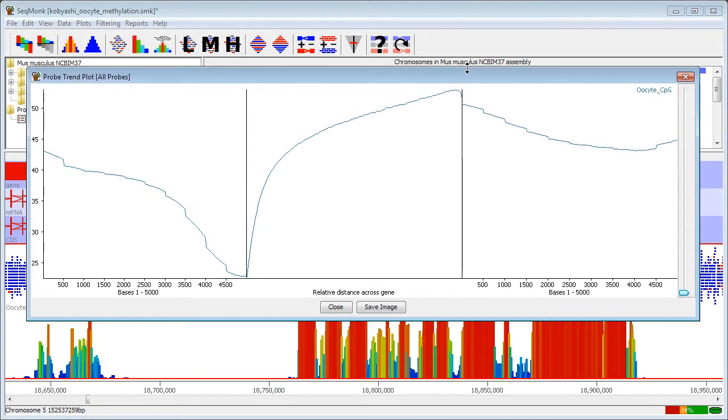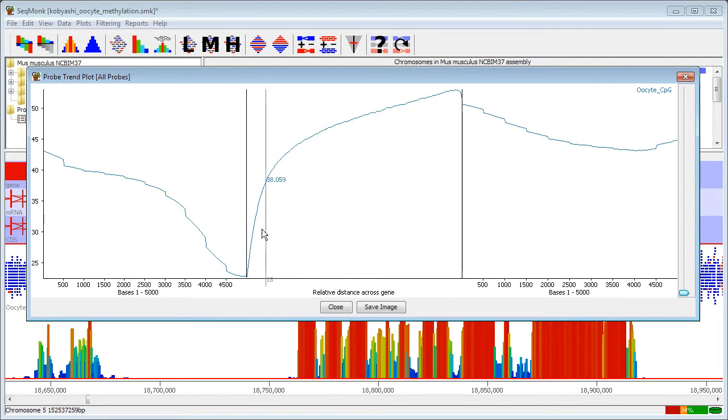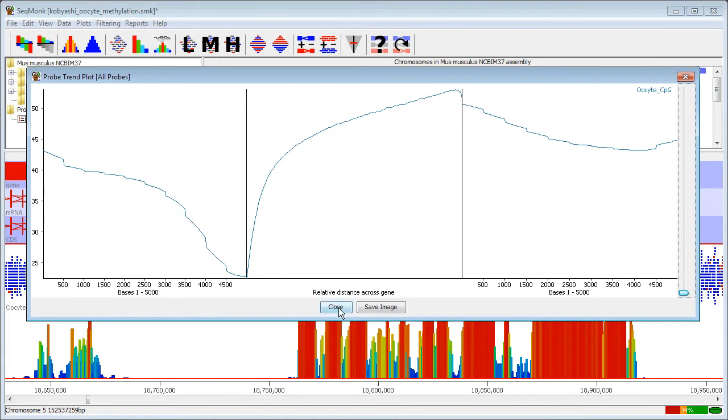So hopefully that gives you a quick introduction as to how to create these fairly complex plots in a fairly straightforward way within Seatmunk.